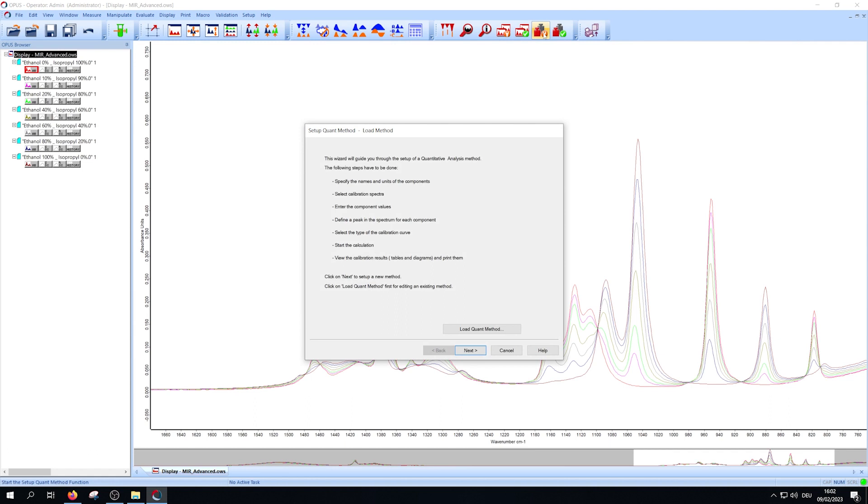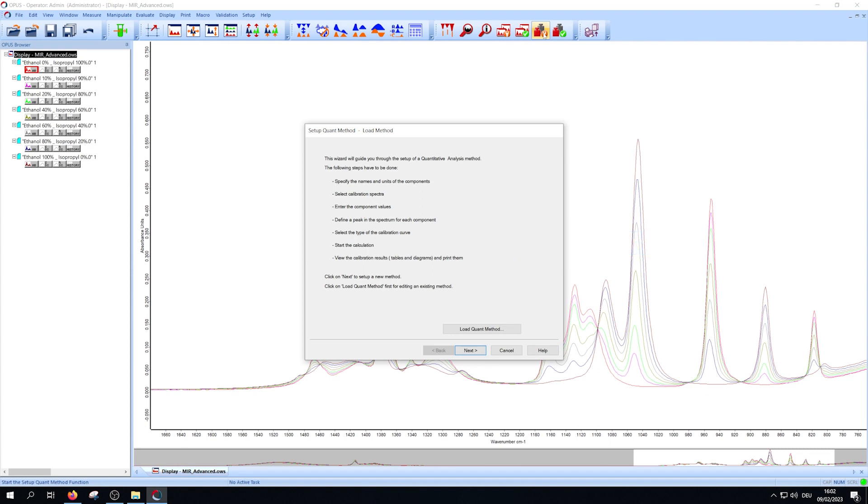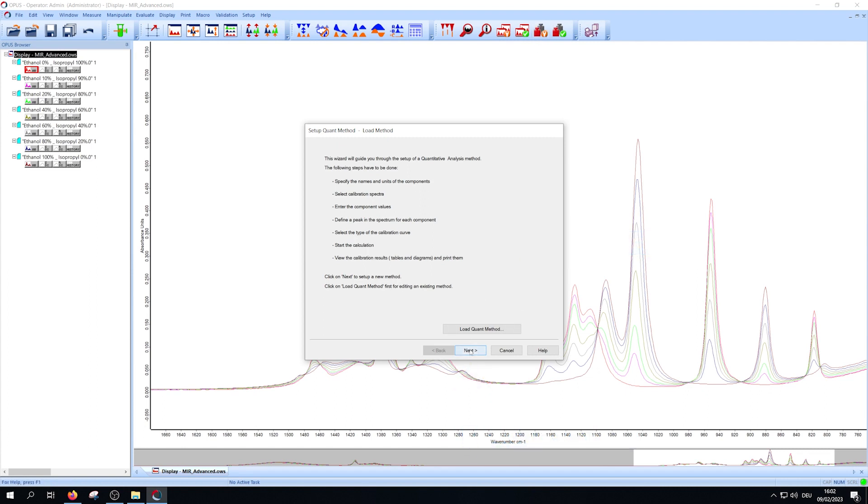You can either edit an existing Quant method via the Load Quant method button or create a new one. To do this just press next.